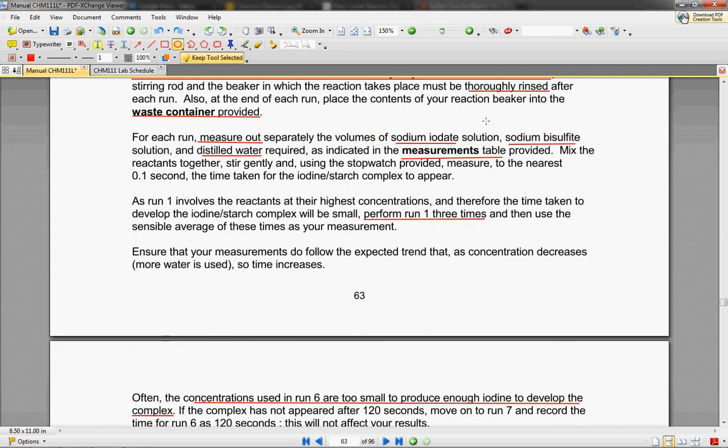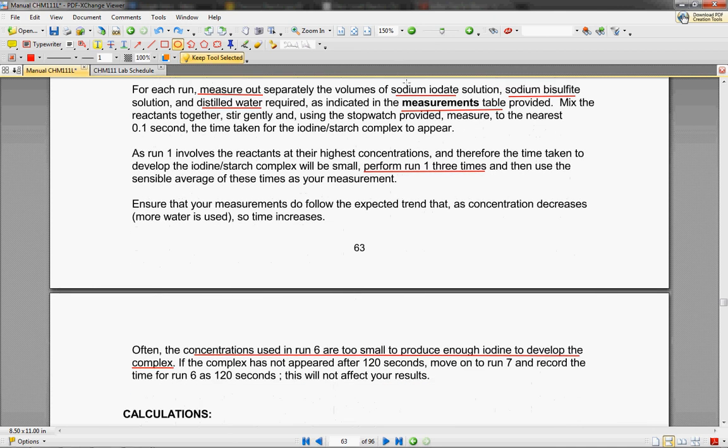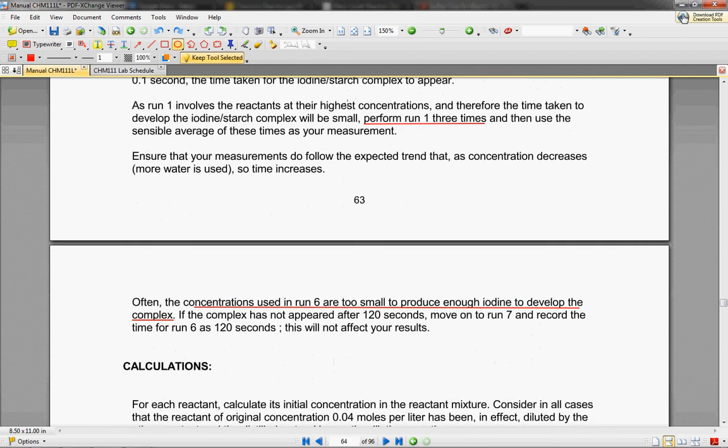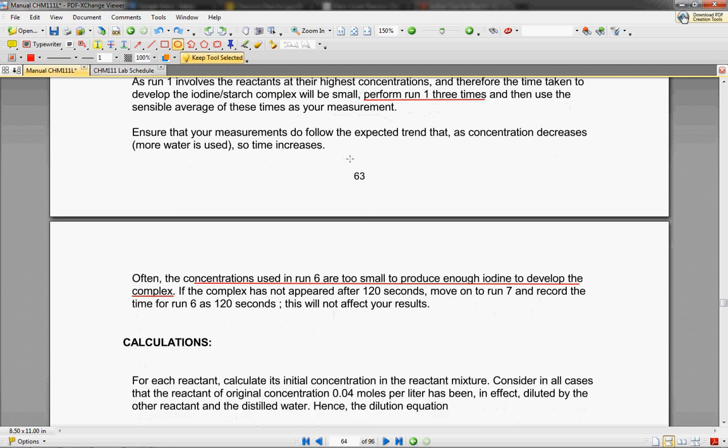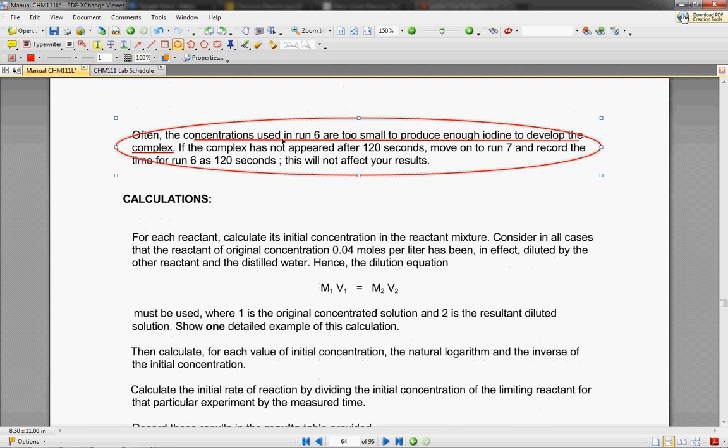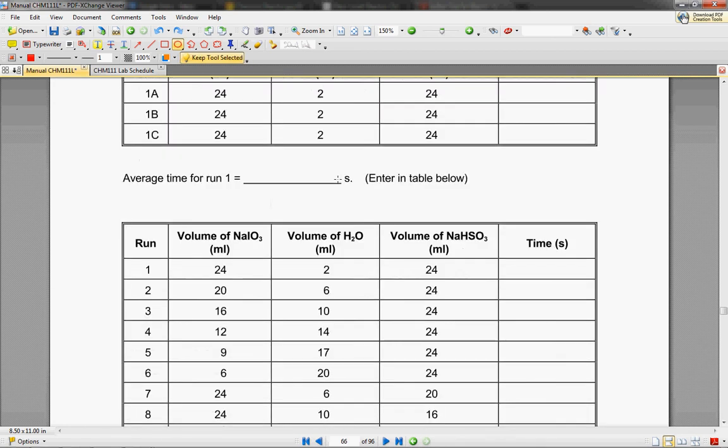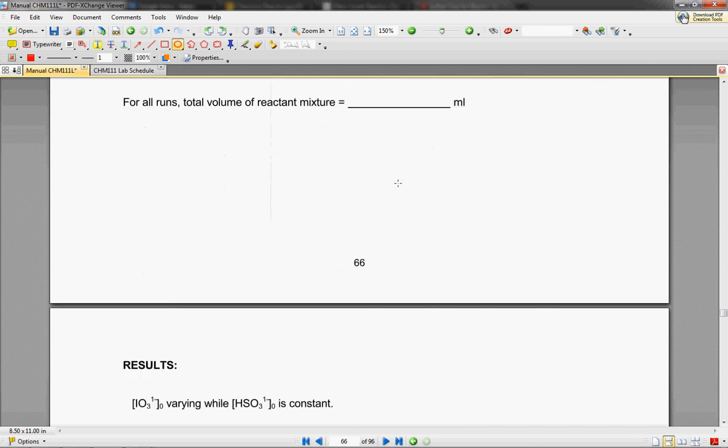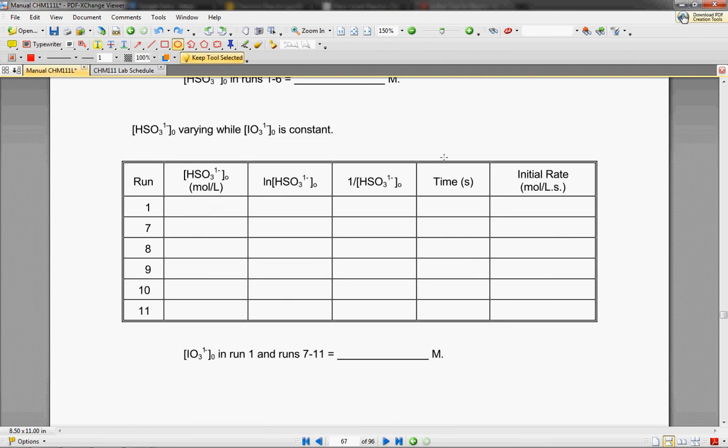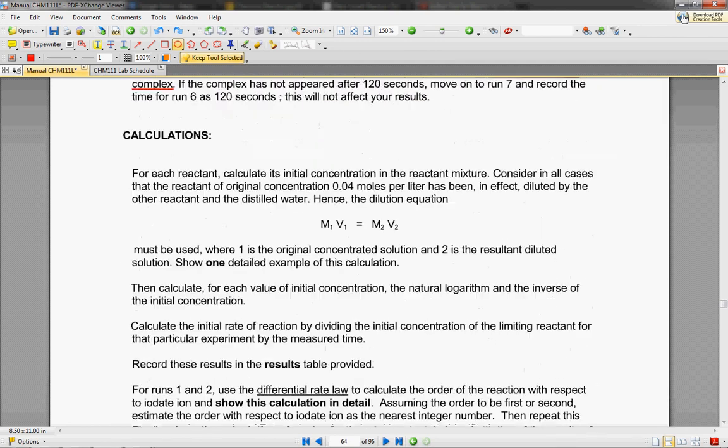We're going to measure out sodium iodate, sodium bisulfite, and distilled water. We're going to measure those as in the table provided at the bottom, and we're going to perform run one three times just because it involves reactants at their highest concentration, so it's going to be kind of hard to get that exact number. There's a note that if you did run six and couldn't get the iodine to develop a complex, then just put in 120 seconds for that run. We're going to mix those and see how much time each took. From that, we should be able to figure out our reaction rates.